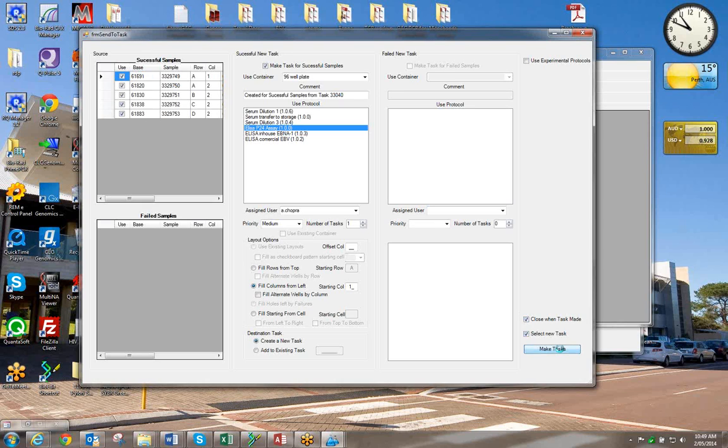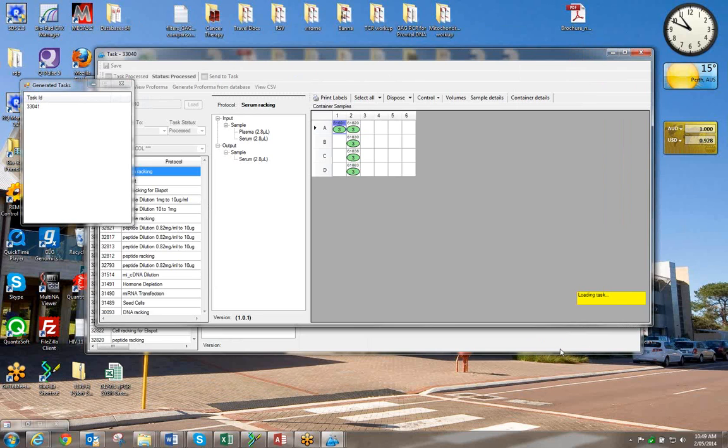Okay, so it's now pretty much going back and doing the same thing over and over again. So if you created the action editor correctly, it should let you go and do everything the way we've done it. So let's see if the CSV file works. Here, so it's going to load the task. So we'll quickly just go through this, and I think we should finish after this.